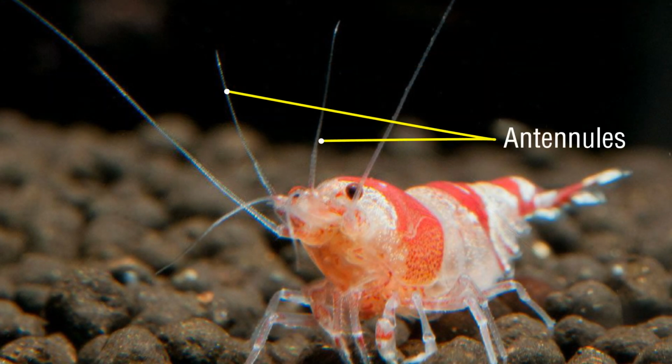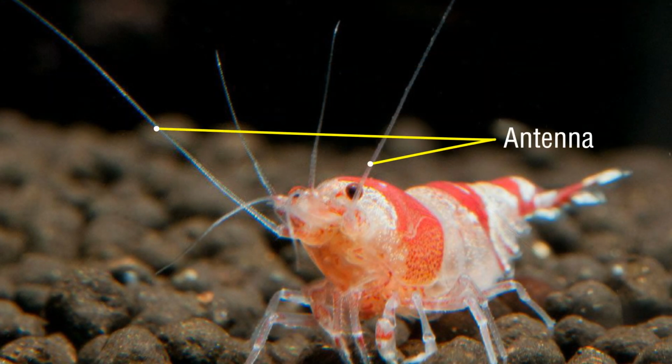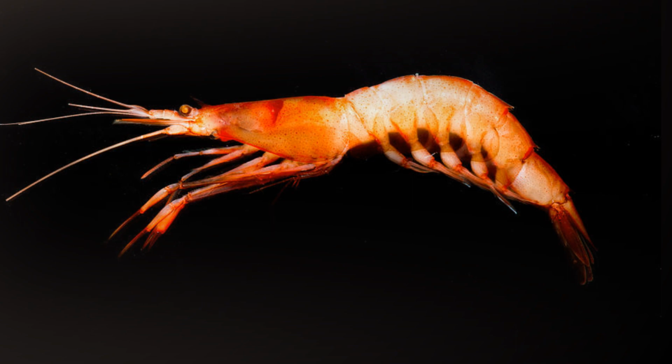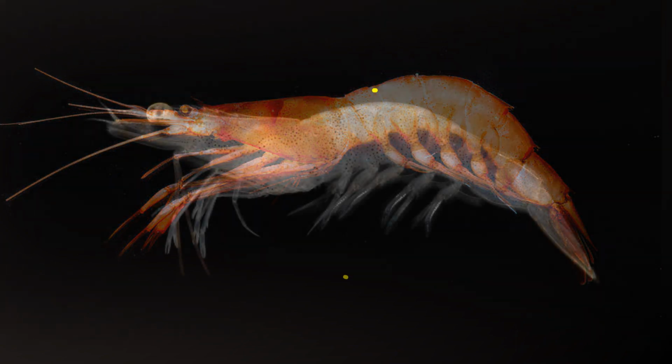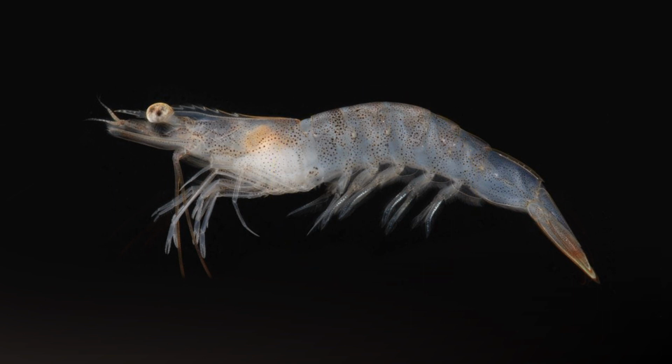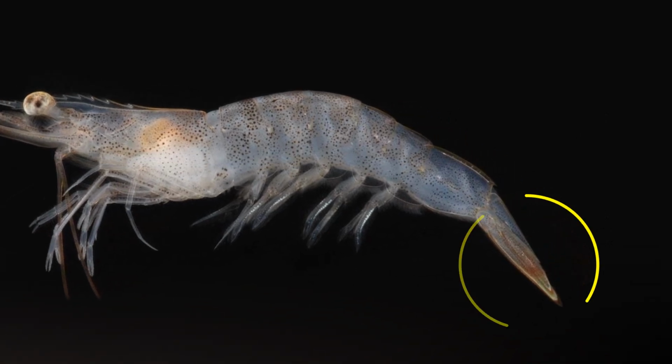antenules, antenna, chelate legs and non-chelate legs are the prominent ones. The appendages of the 5 anterior abdominal segments are called the pleopods or swimming legs. The appendages of the last abdominal segment are broader and are called uropod.